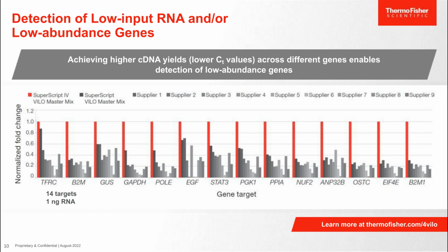The thing to observe here is that there are huge differences in the data among the RT reagents. The efficiency of the master mixes is all over the spectrum, which means that the choice of RT reagents for your experiment has a huge impact on your CT value, which affects your end RT-qPCR results and ultimately your interpretation of your gene expression results.